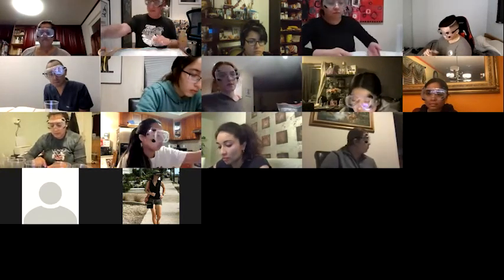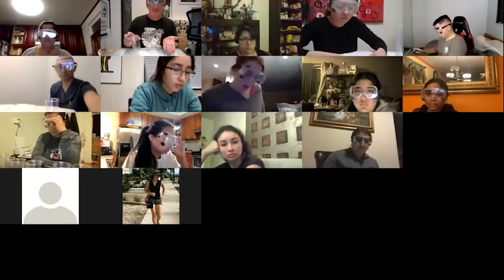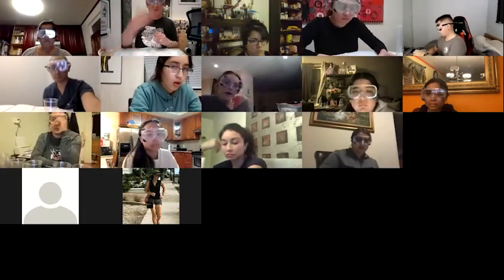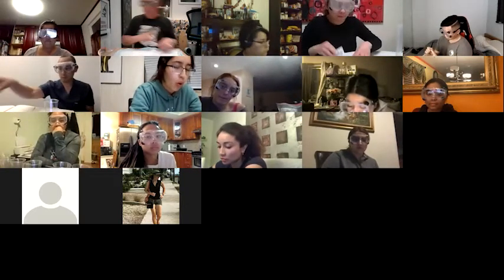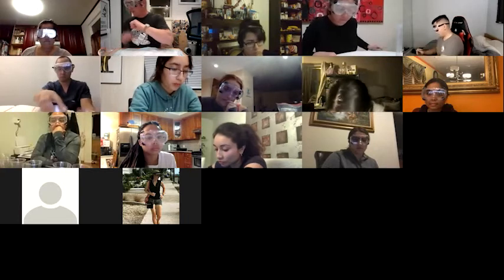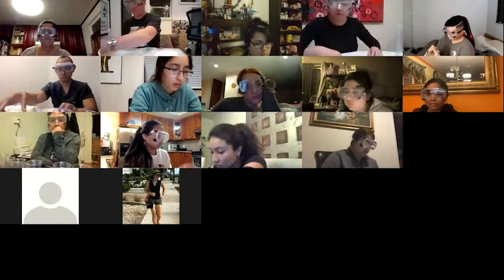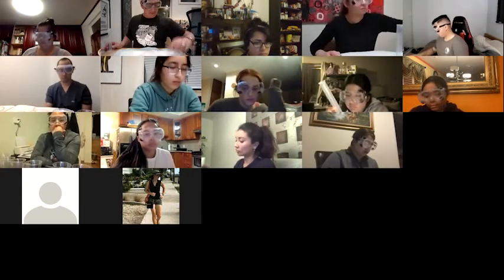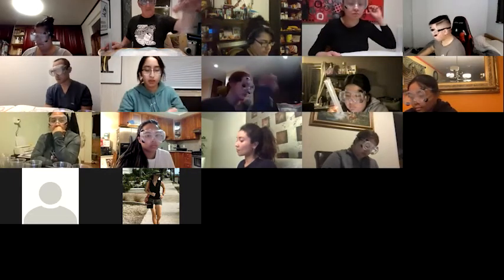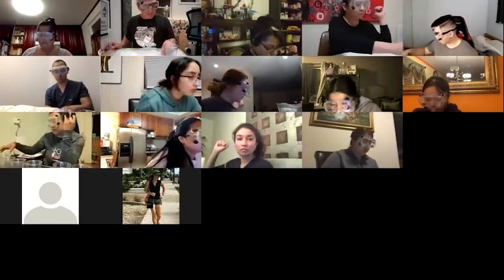So then when I take the cup off, now it says minus 10 grams because it's been tared. So now I have to tare it again. Okay. So I want to measure 50 grams of water. So I put my cup on. I'm going to tare it to 0.